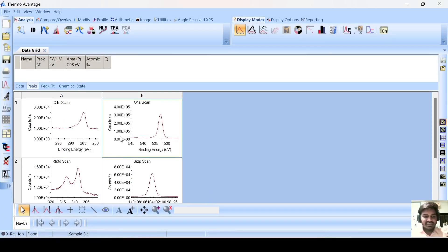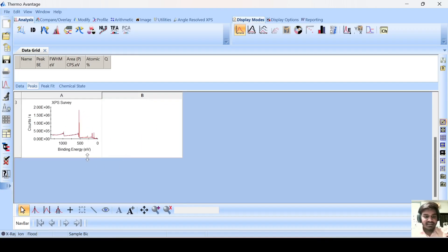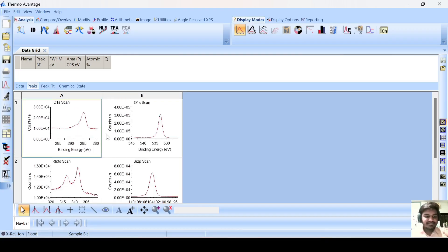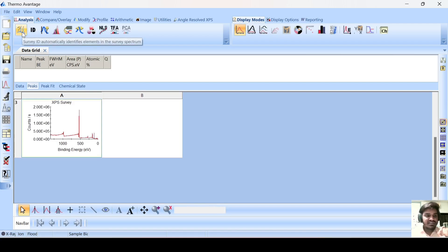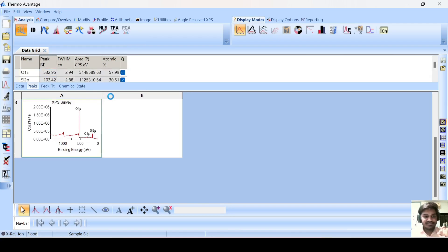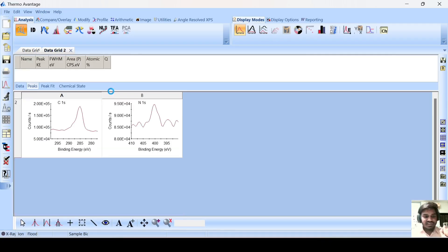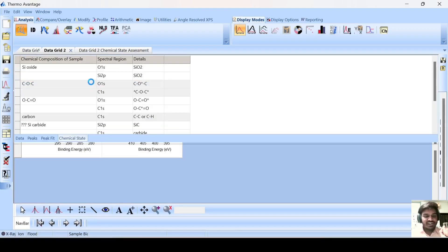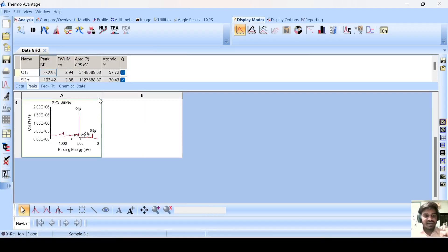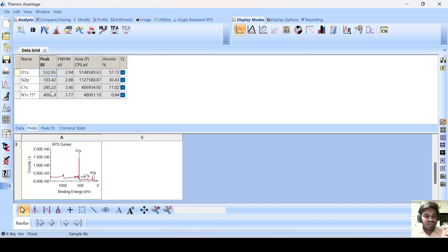These are the narrow scan spectrum for a particular element. Here is the extensive survey spectrum. If you want to know how many elements are present in this material for your sample, click on here, go to this and click here. You will get a table in which all the possible elements present in your material will show here.